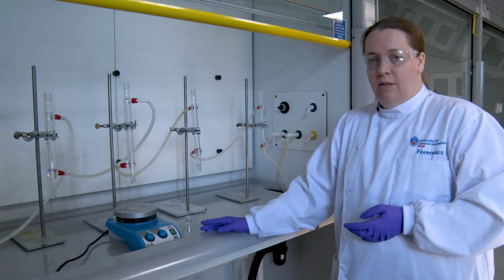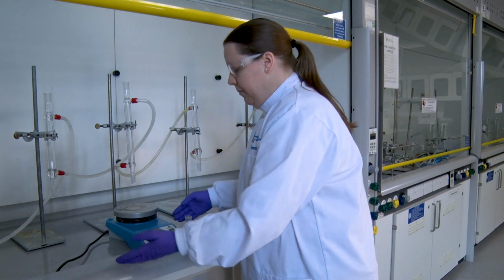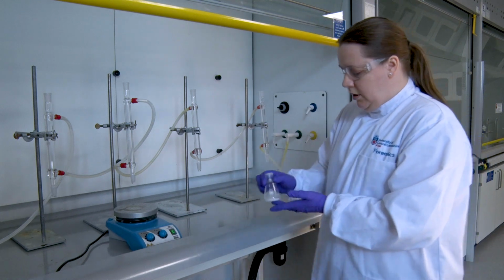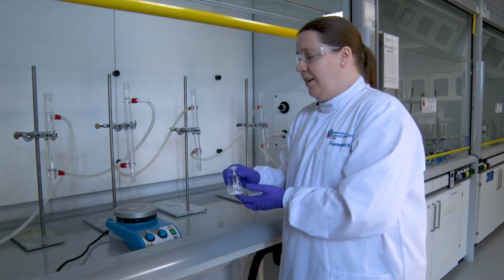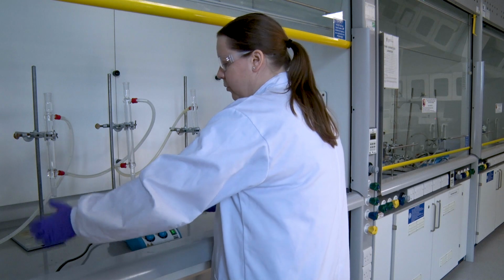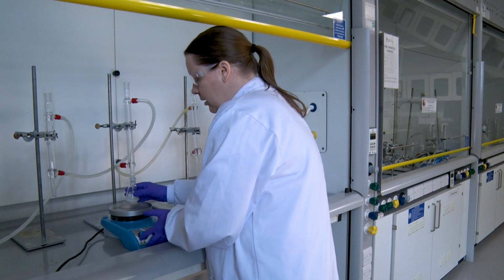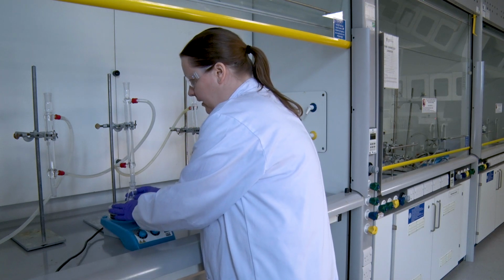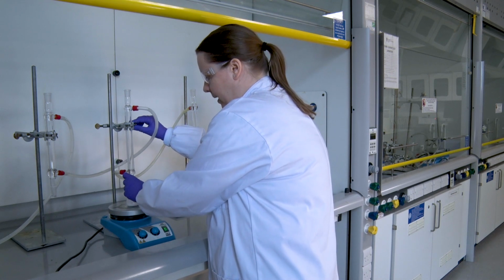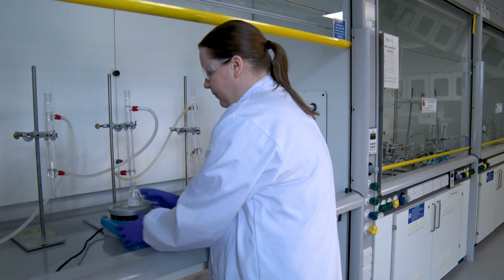You may have a hot plate in the fume hood, you may not. If there aren't hot plates, you're just going to bring your own and plug it in underneath. If there are, use the one you've got. So, as I say, you've got your flask with everything in, and your anti-bumping granules in. Come to the condenser you're using. Be aware there will be people working beside you. So you're going to pop your condenser on, move your hot plate so it's at the centre, and then carefully undo the clamp to drop it, and then tighten it up just a little bit so it's holding it.